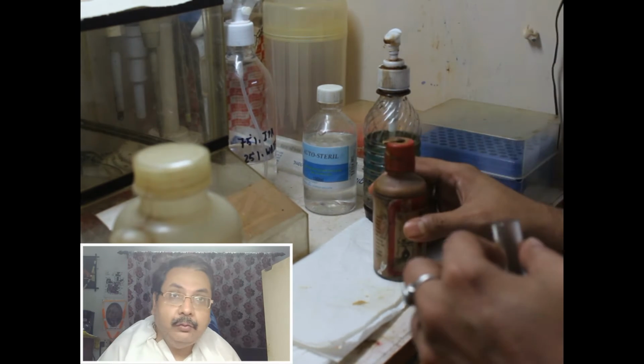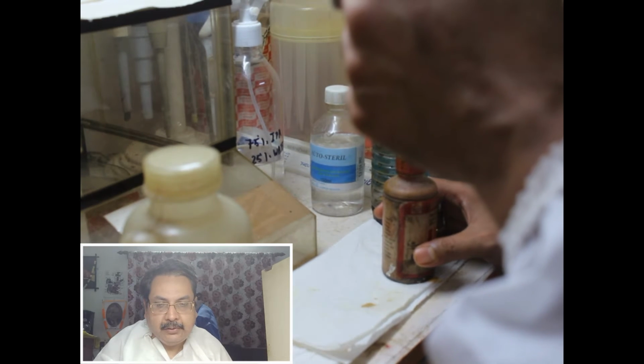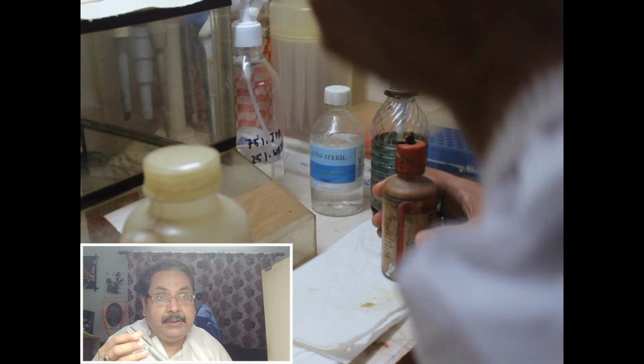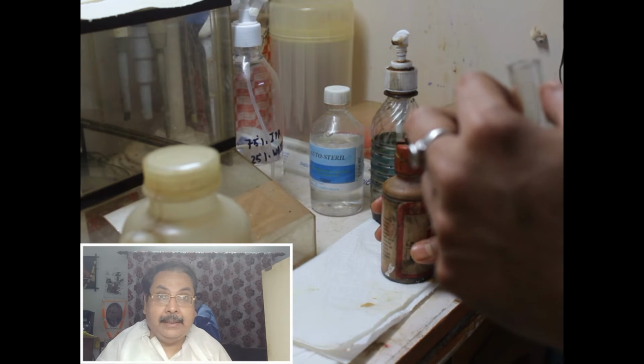Now this is called universal indicator. This indicator will give you a color. So what is the color? The color of the pH of this water. So it should be green or light green, not any other color.